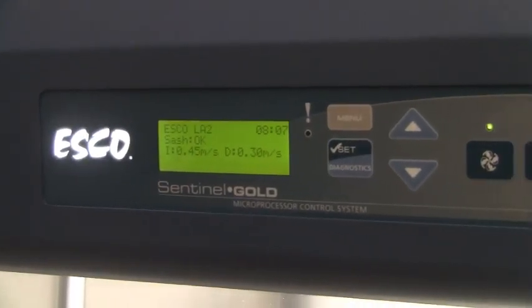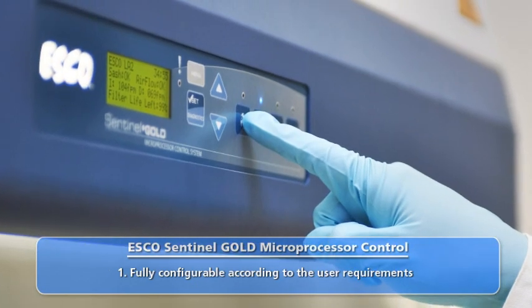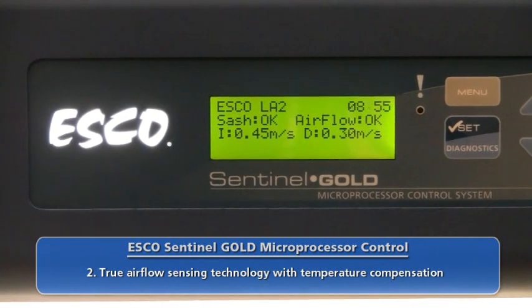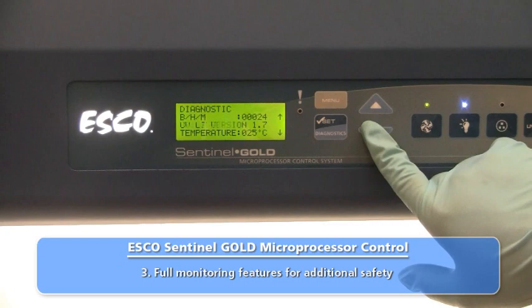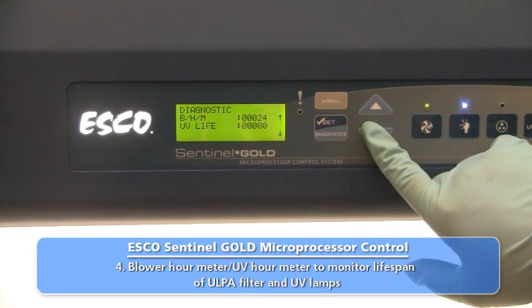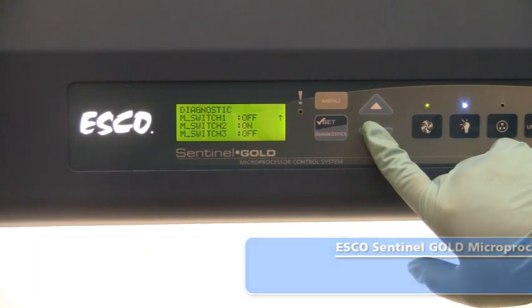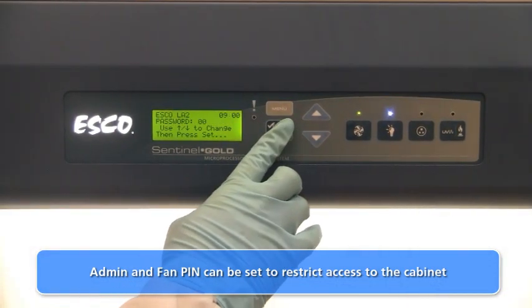LabCulture Class II Type A2 Biosafety Cabinets are equipped with the Sentinel Gold microprocessor control system. All control features and functions may be configured to suit the user's requirements, and cabinet air velocities are continuously displayed on the LCD screen. The Sentinel control provides intelligent hardware diagnostics and generates error message reports. The control system monitors blower usage hours to gauge filter life span and alert the user when a replacement is required. Cabinet airflow velocity settings may be calibrated directly from the microprocessor control system. For security purposes, access to the cabinet menu and operational functions may be restricted by setting password locks.